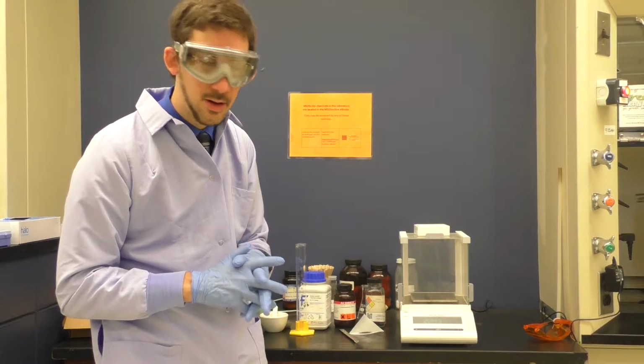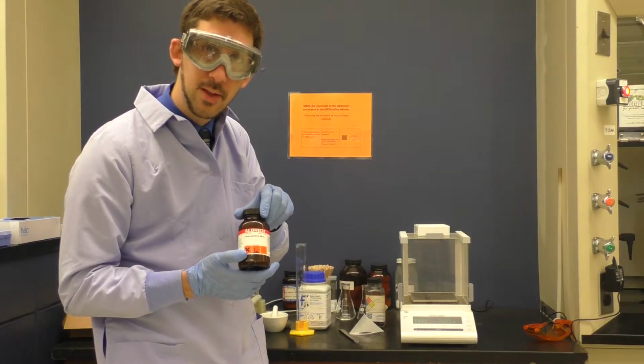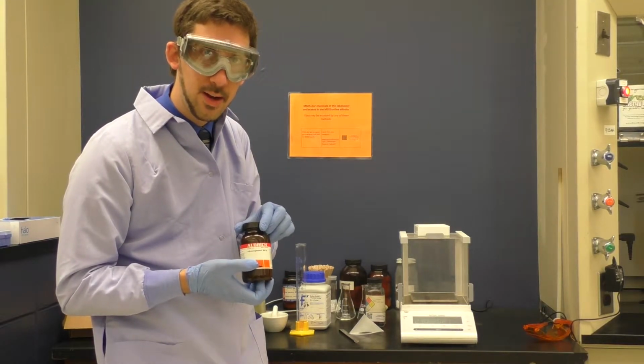So we'll get this started. We'll weigh out our 4-aminophenol here. We'll weigh out 2.5 grams of this, and then we'll proceed with the decolorization process.